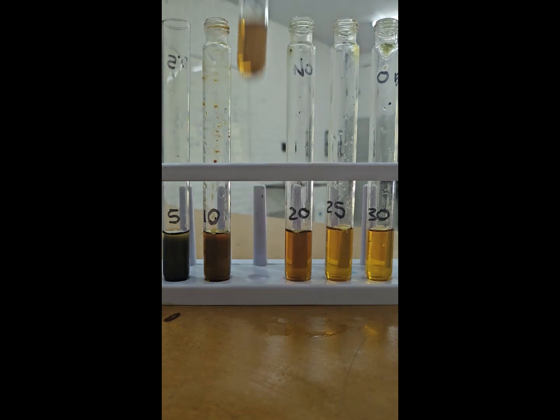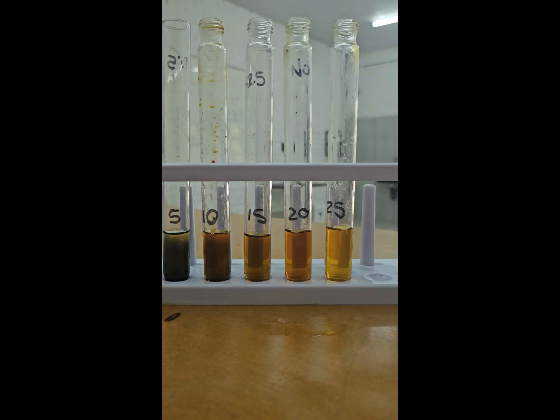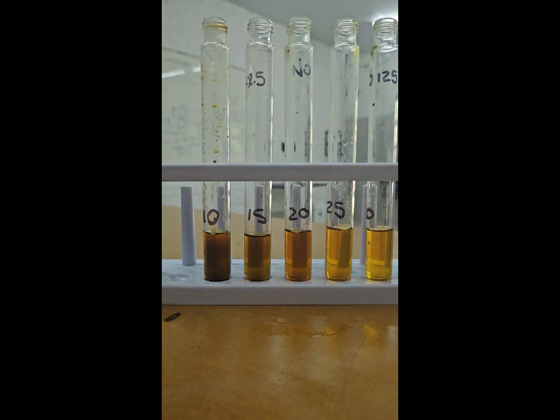The problem with using color to determine the rate of an enzyme reaction is the fact that it is more qualitative than quantitative. So it's also very subjective, meaning that what I would see with my eyes, which is that the reaction was completed between 20 and 25 minutes, might change from person to person. Another person might say that the reaction stopped just before 20 minutes, and someone might say, no, it's between 25 and 30 minutes.